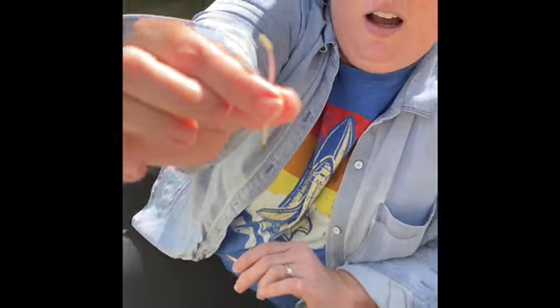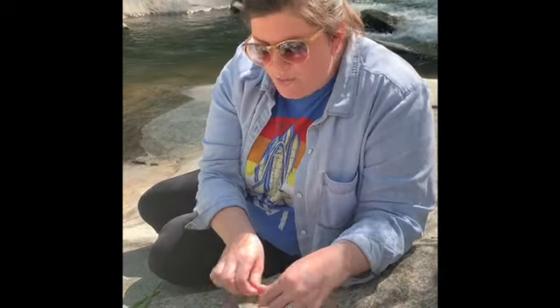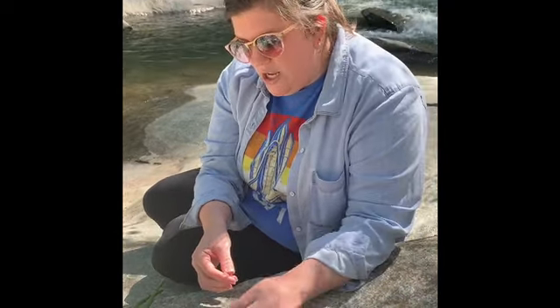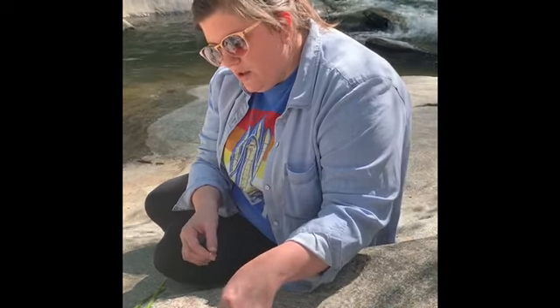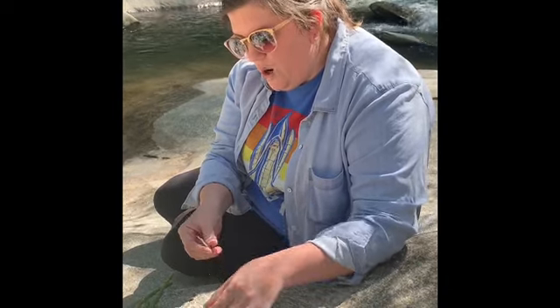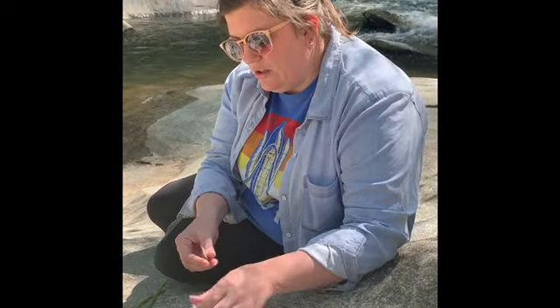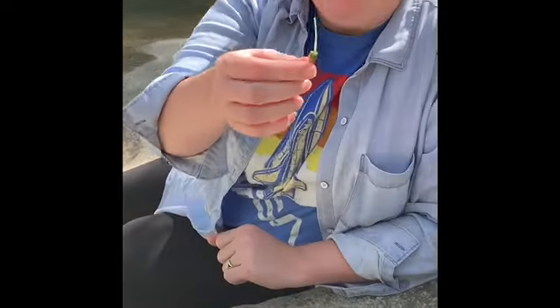So get that close where you can see it. Alright, so you have the stamen, again, which is the anther and the filament. So we'll count how many anthers and how many filaments we have. So we have 2 anthers, 3, 4, 5, 6. Alright, and then we have 1, 2, 3, 4, 5, 6 filaments.